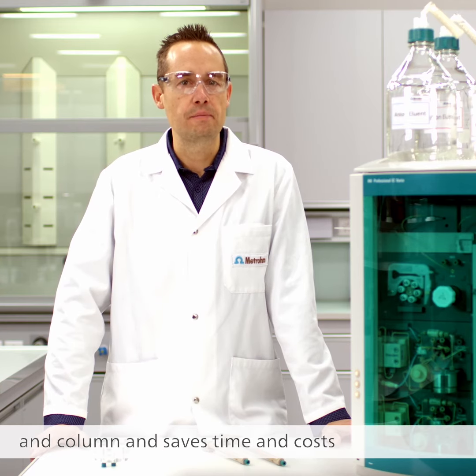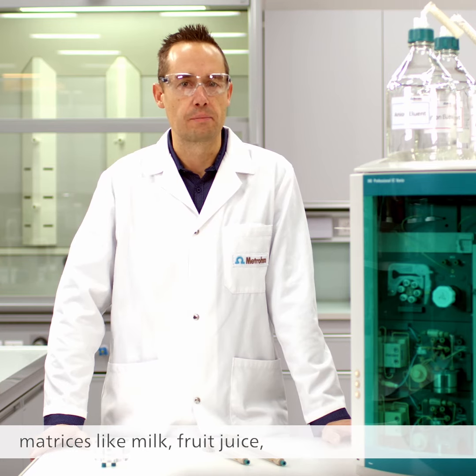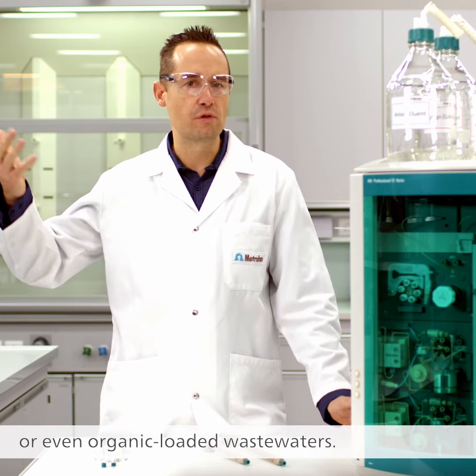It saves time and costs when you analyze samples with difficult matrices like milk, fruit juice, or even organic-loaded wastewater.